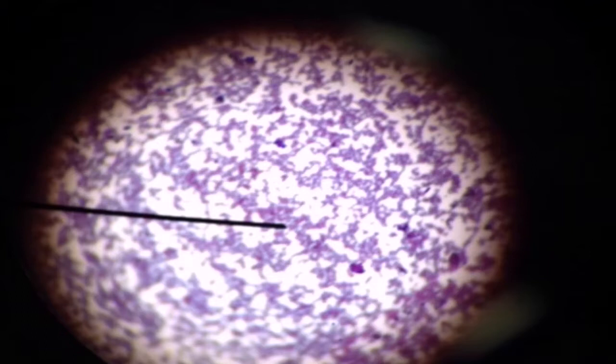Our results had growth on only 2 plates, exiting floors 2 and 3, sample 1. Both of the samples had colorless colonies, therefore they do not ferment lactose. Salmonella was most likely the type of bacteria that is on our MAC plates. We arrived at that conclusion using the following reasoning. E. coli ferments lactose, and Streptococcus pyogenes, Staphylococcus epidermidis, and Staphylococcus aureus are all gram-positive.